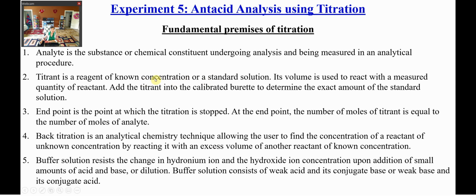Usually we consider this a standard solution. The volume of your titrant is used to react with a measured quantity of your reactant. This is your unknown sample, also your analyte. Add the titrant into a calibrated burette to determine the exact amount of standard solution.